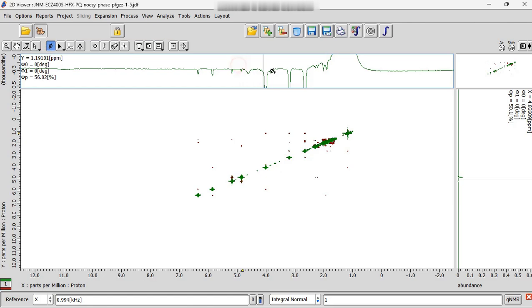This pivot line can be fixed onto the right side peak which has a phase error. Now adjust the phase. Slide holding the left click in the mouse and move horizontally. This phasing will be adjusted. This corrected phase value shown here can then be applied to 2D spectra. To apply that, hold right click in the mouse and drag it in the middle. Similarly, now PH0 has been done.